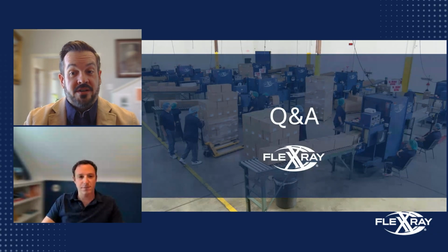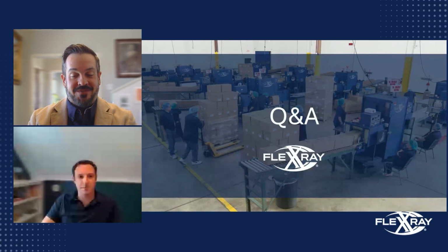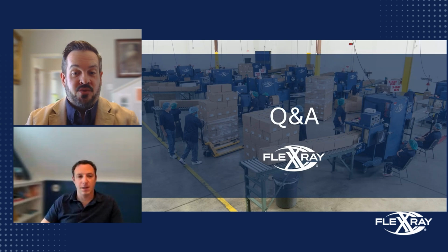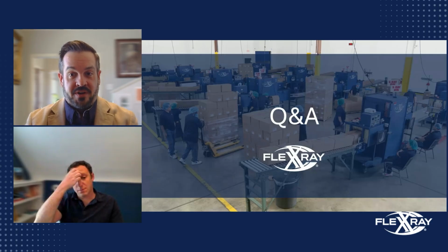Yeah, if I were to purchase one, I'll go back to my previous life in QA in a plant environment. It's large. There are very few plants that I've been into that it would fit inside a production line setting. That's not to say that they can't be leveraged that way, but we're typically running in the 20 to 30 feet per minute range from a CT standpoint, and that's just not conducive to maintaining what we see as typical production speeds.